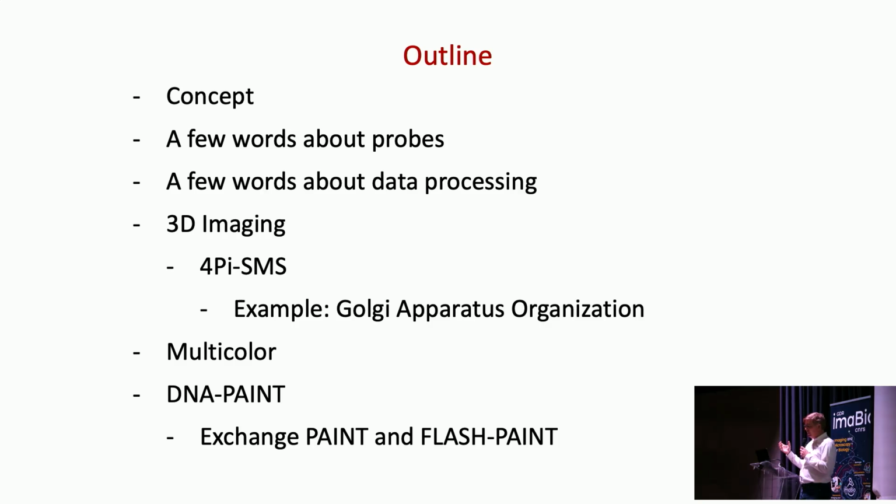And then in the remainder of the talk, I want to focus more on multicolor imaging. And in that context, also want to go a little bit deeper into DNA paint imaging, and then into Flash Paint imaging, which is a development from my lab from last year, which is a multiplexed super resolution microscopy advancement.